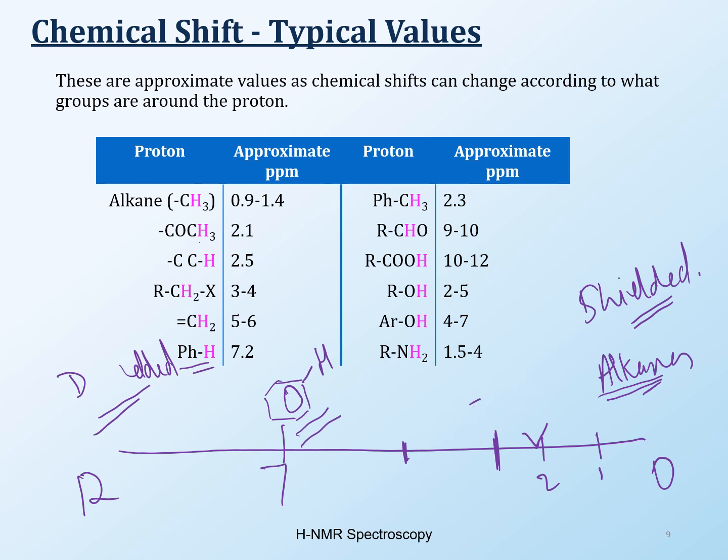So other things I just want to mention here before I move on from this: look at this aldehyde proton, it's coming around 9, and then the acid proton, okay, now it's attached to 2 oxygens here, very much deshielded, okay, and that's going to be coming around 12 ppm, okay? So alcohol is variable, right? You can see that 2 to 5 ppm. Like, where am I supposed to see this? So how can you memorize these things when you don't even know where they'll show up?